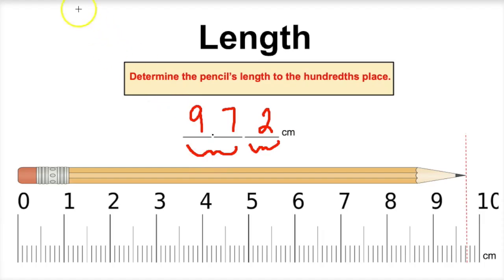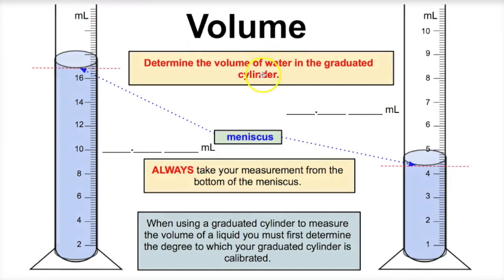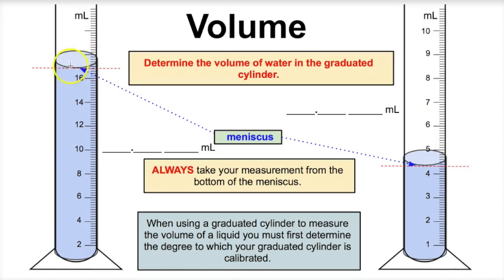Let's take a look at how we're going to use a graduated cylinder to measure the volume of different liquids. We have a graduated cylinder here filled with water, and another one as well. The first thing you'll notice is that if you get down eye level with the graduated cylinder and the level of the water, you will see what is called the meniscus. The meniscus is kind of this bowing or concave little line where the water meets or is inside of the cylinder. We always want to take our measurements from the bottom of the meniscus.